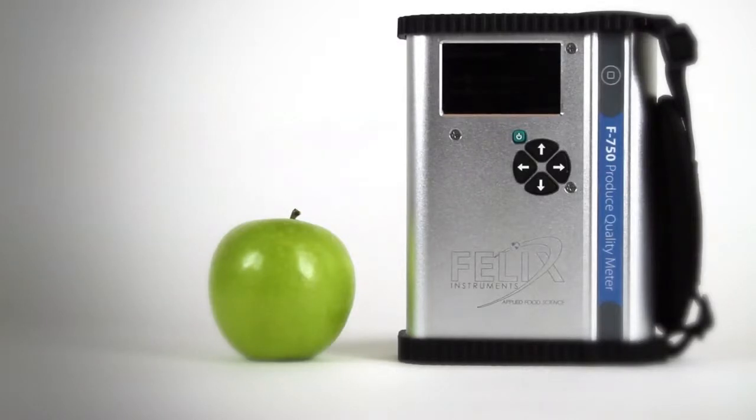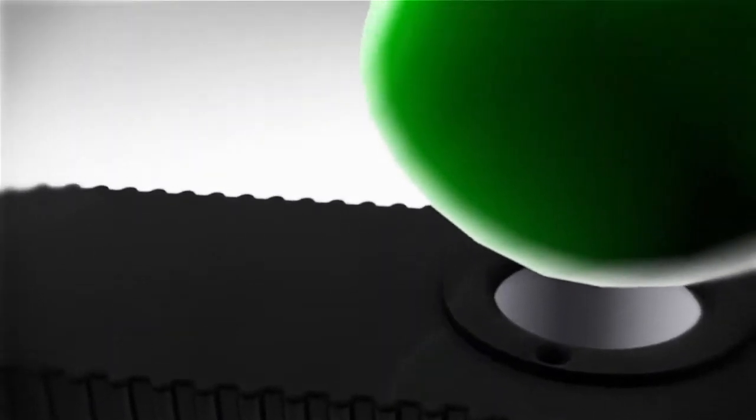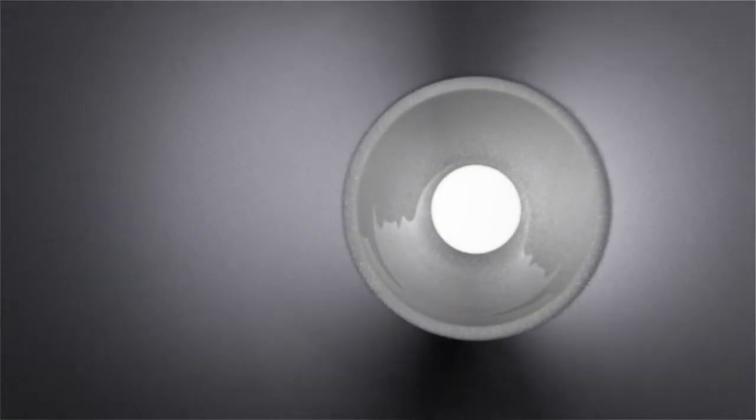The F750 Produce Quality Meter uses an interactance optical design to collect information from tissue of many commodities. The F750 uses a halogen incandescent lamp to provide visible and near infrared light.